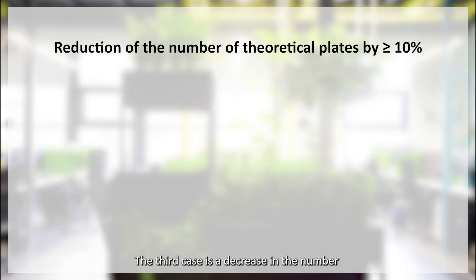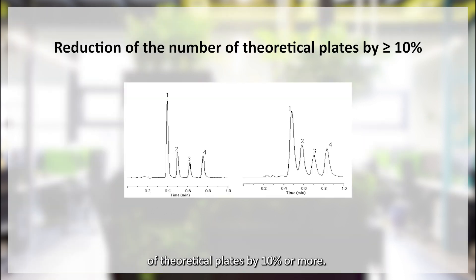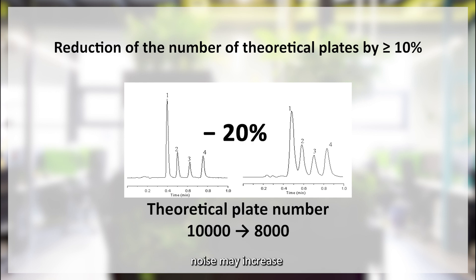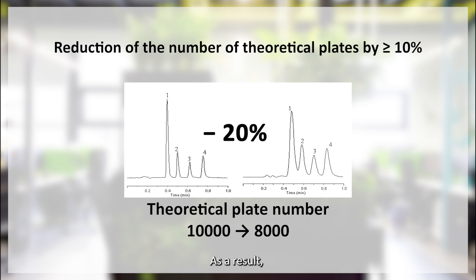The third case is a decrease in the number of theoretical plates by 10% or more. If a column becomes dirty, noise may increase or peak shapes may deteriorate. As a result, the number of theoretical plates will gradually decrease.